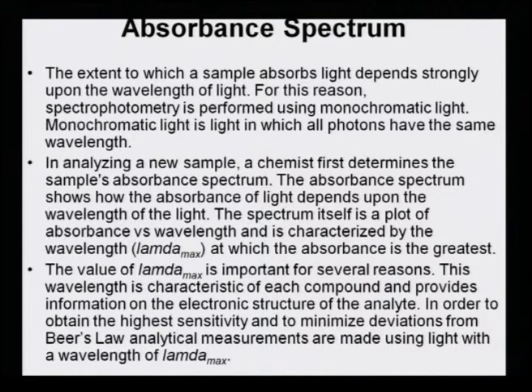So, when the light is incident and the analyte has a matching chromophore or excitation moieties within the molecule, those portions will get excited, and the absorbance is directly proportional to the concentration, and the wavelength of a characteristic compound remains the same.